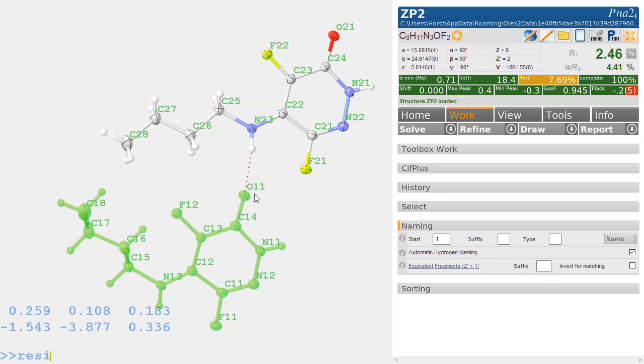Double click on this and the command is Resi. We need a name first, so let's just call it MOL for molecule. I think you can use three characters, maybe four. Resi MOL -all. This will now find all of these residues in your structure. It will find the two of them, and the labels are still showing the way they are, but you might have noticed they actually changed to the same. We've got now 18, 17, and so on.